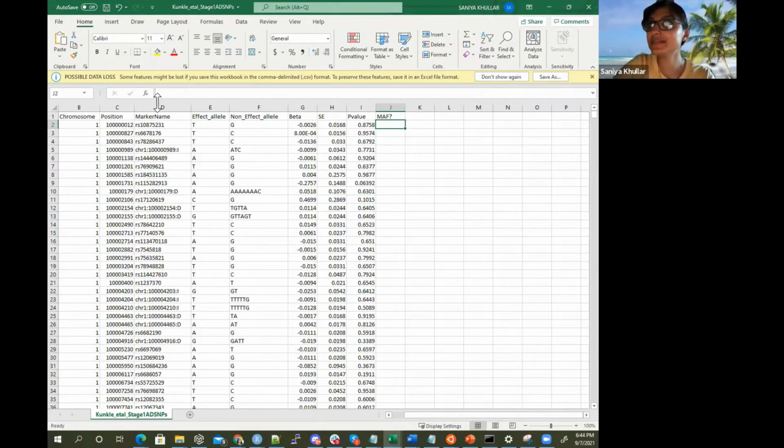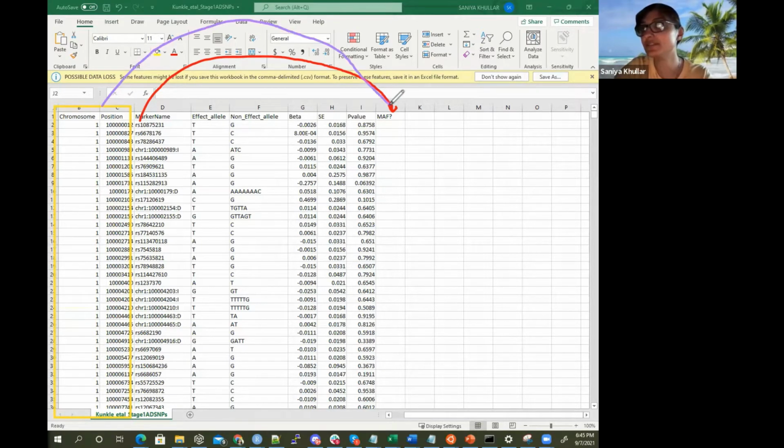You will also learn in this video how we can go from an rsID to figuring out the minor allele frequency. That's one thing we can do, going directly from the SNP IDs. There's another alternative, which is going from chromosome and position information, all the way to figuring out the minor allele frequency as well. These are the two different alternatives, and I'm just going to show that to you guys. So let's get started.